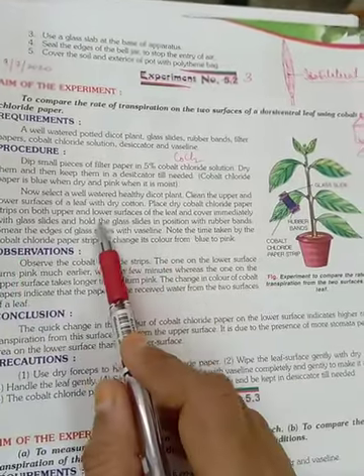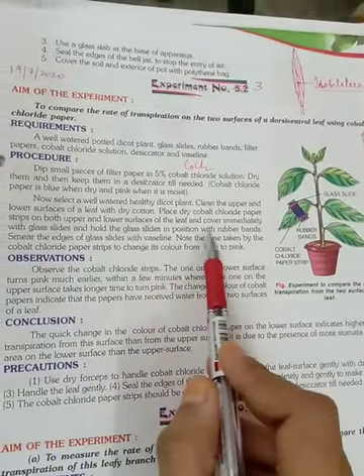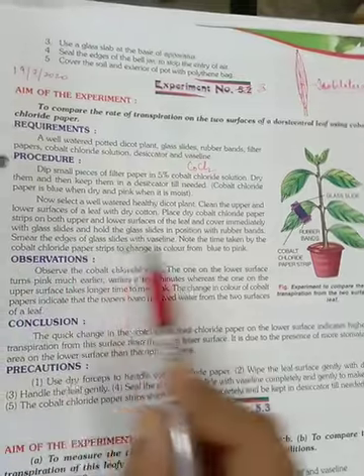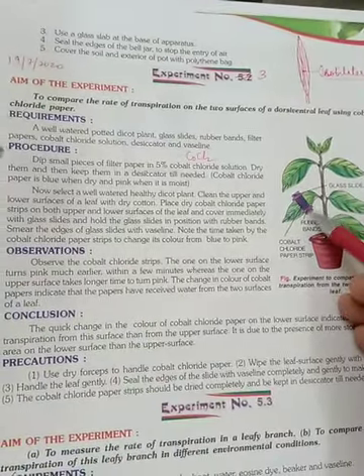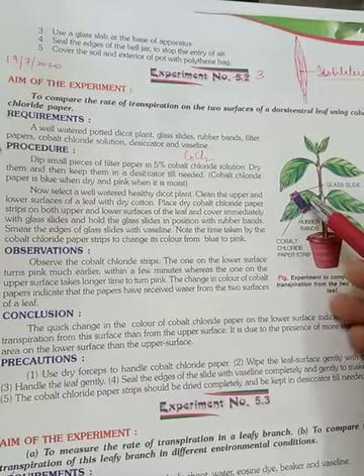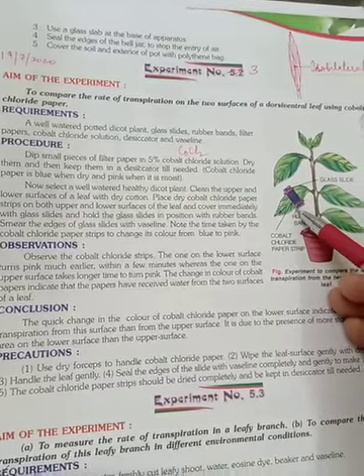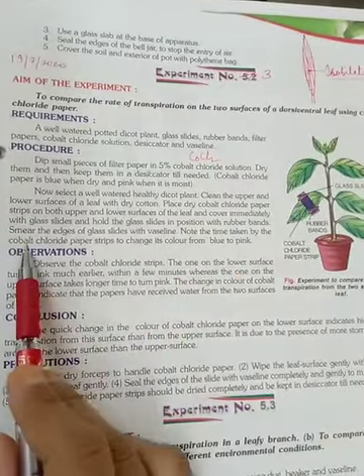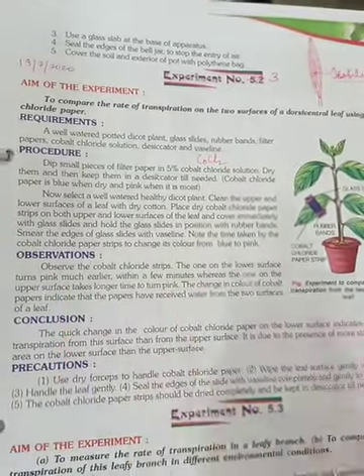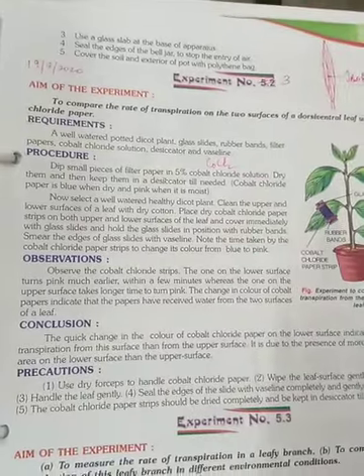Then, hold the glass slides in position with rubber bands. Smear the edges of the glass slides with Vaseline. Now see, you have to make it totally airtight. So wherever the edges of the glass slides are touching each other, we'll apply Vaseline to make it airtight. Note the time taken by the cobalt chloride paper strips to change color from blue to pink.